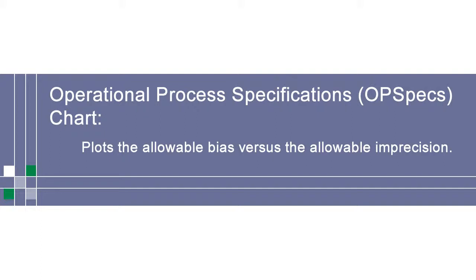First, we'll work on understanding OPSpecs charts in the abstract before looking at them in the context of the software. Our OPSpecs charts always have the test listed in the bottom left corner. You'll find the header for the chart listed across the top. In this case, the TEA is 11.6%, with an AQA of 90%.